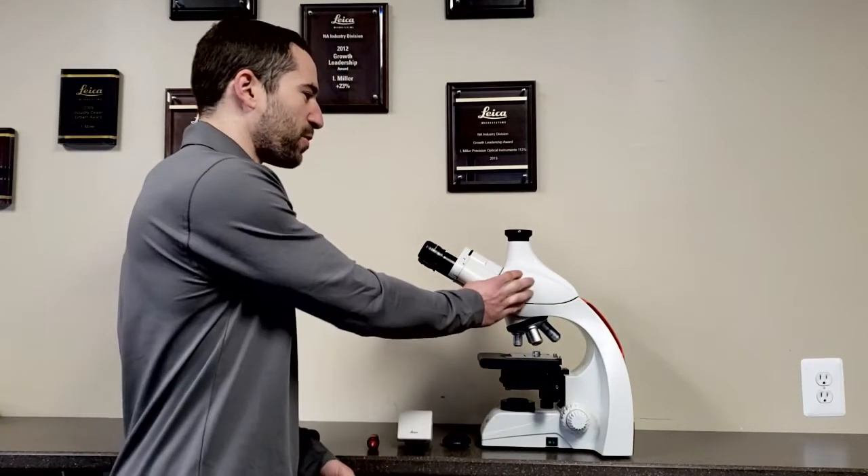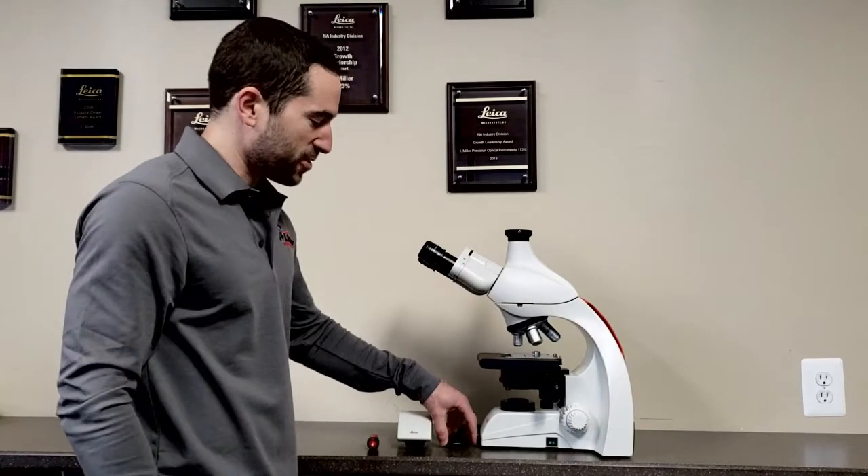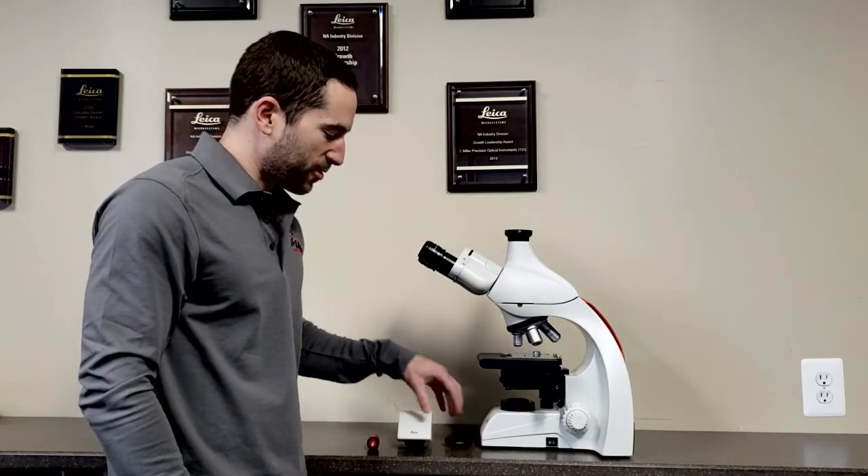Scott from iMiller Microscopes, focused on use since 1936. Today I'm going to show you how to mount your microscope camera onto your microscope. You're going to need three things: your microscope with the trinocular head, your C-mount adapter, and your camera.